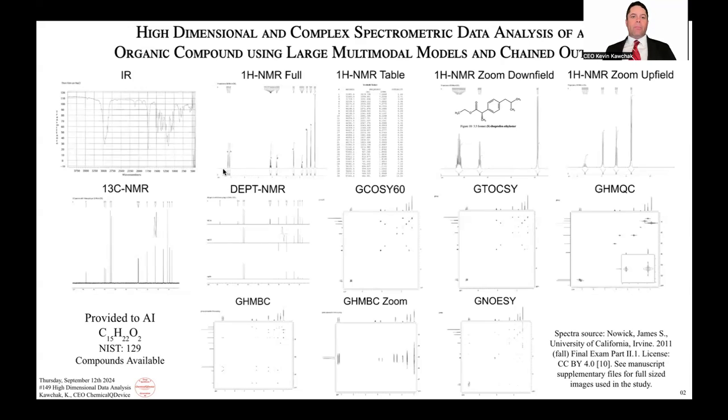And we see in the proton NMR, it's basically this, H22. And all of these made sense, right? The two groups of aromatic protons, those are going to be 2 and 2. The diastereotopic protons, which is the CH2 to the left of the ester bond here, you can see the zoom right here. It looks like 14 peaks, but there's kind of a boundary in the middle. So I counted it as a doublet of quartets, and so that'd be 16. It looks like there's probably some overlap in there.